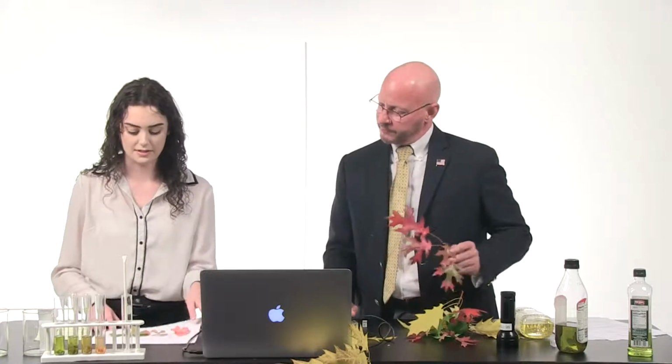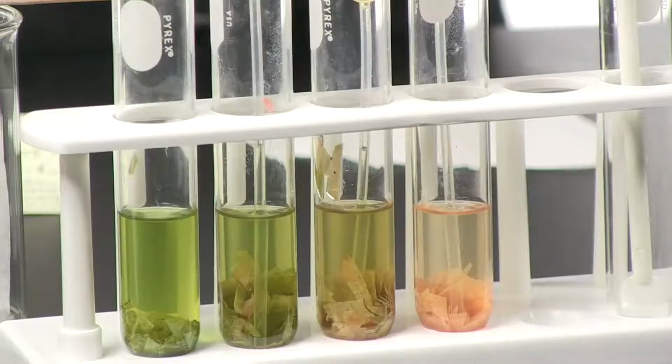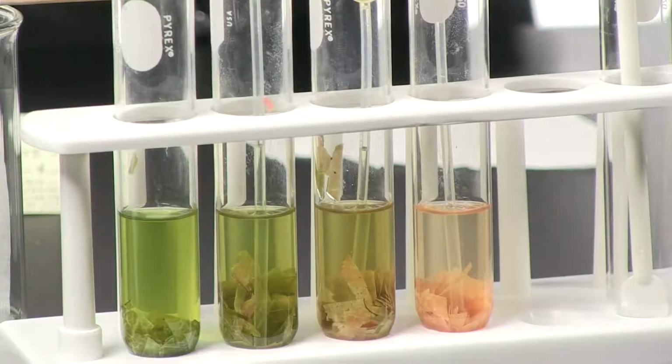Now, as we continue on throughout the seasons, as Mackenzie was explaining to me, we actually get to the point where the chlorophyll practically degrades altogether. Yes. Those beautiful red leaves that we see outside. What happens there? So what happens is as the seasonal senescence progresses, we're going to see almost no chlorophyll in the very last sample. So we should see these peaks get much lower.